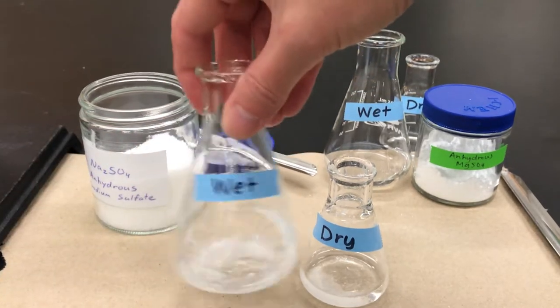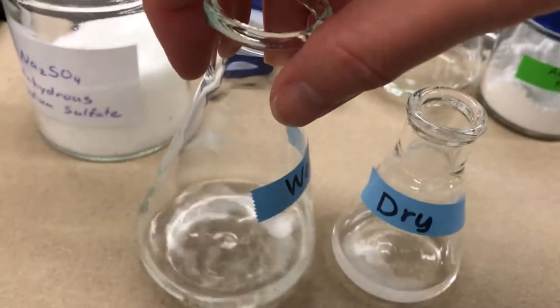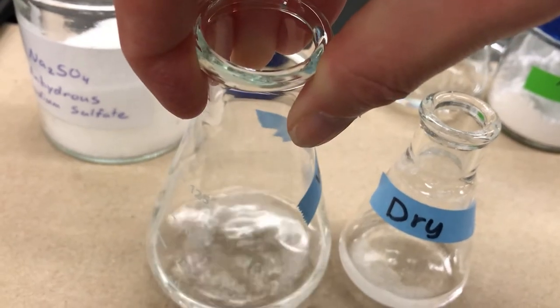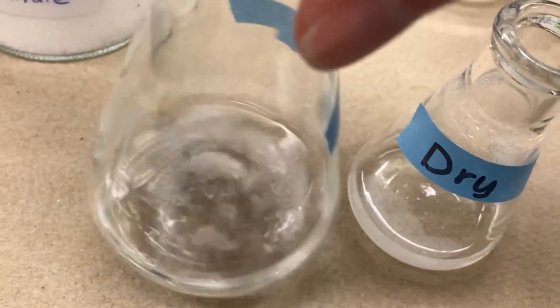Give it a swirl — those clumps are still going to be there, but what you're looking for is that new portion that you added. Are those particles small? If you jiggle it around, can you see tiny particles instead of just big ones that stick to the glass? If they're loose and small, that means it's now dry.